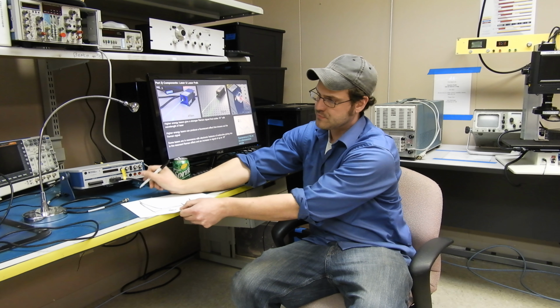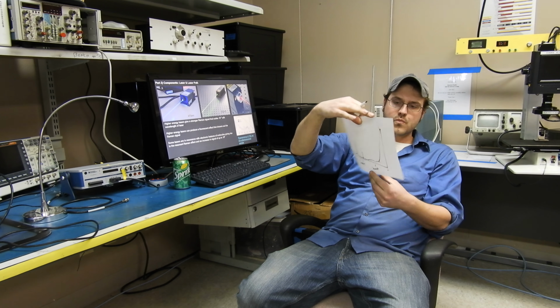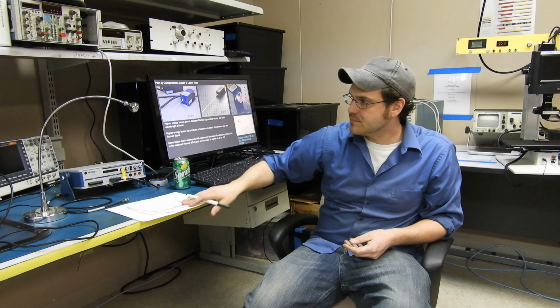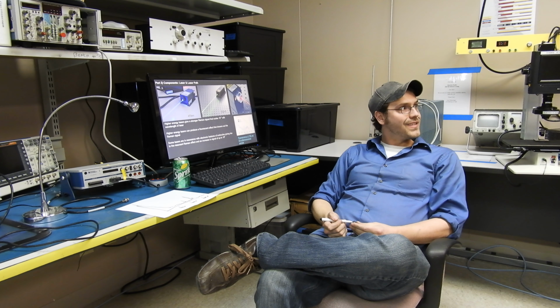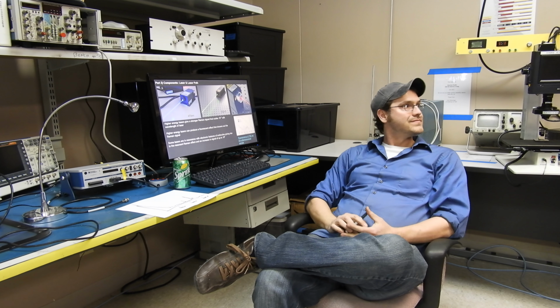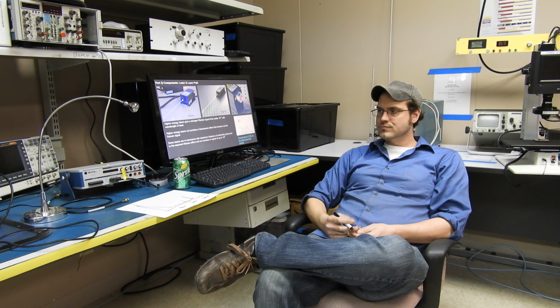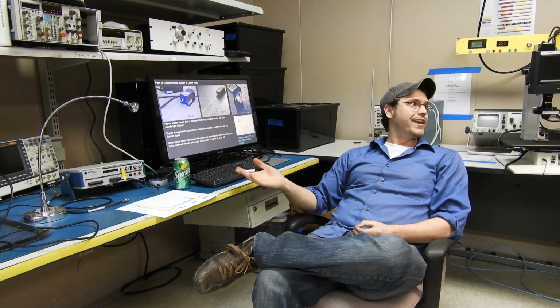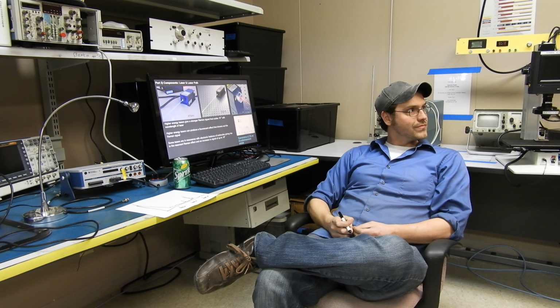just kind of goes. Yeah, and they probably normalize that out. So if you're interested, they're probably going to normalize that out, because I remember doing that process many times in that lab. The normalization, I had to automate the normalization process, so we would see only the information we were trying to extract from our test sample. And so they're going to do stuff like that.